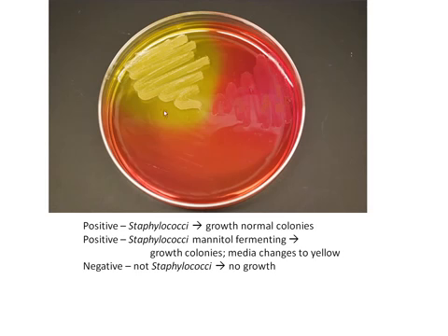However, you see no change in the media in this area, so we had no sugar use. In this area, bacteria is growing and the pH of the media decreased, causing the media to turn yellow. This tells us that in this area, the bacteria grew, so they were halophiles, and they used the sugar present, which is mannitol.